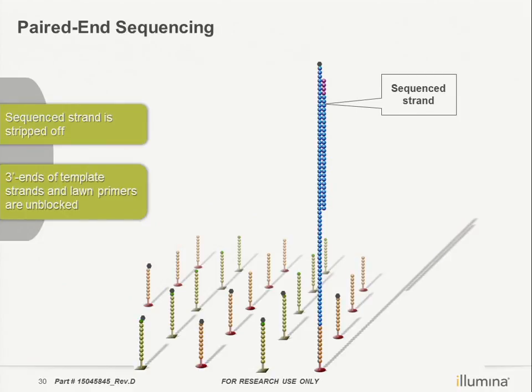What it does is sequence both the forward and the reverse strand. The following slides will talk about how to do it. This is sequencing by the primer, read 1. It's the final step of the cluster generation that this primer binds to the template. Still remember, we mentioned this in a few earlier slides.